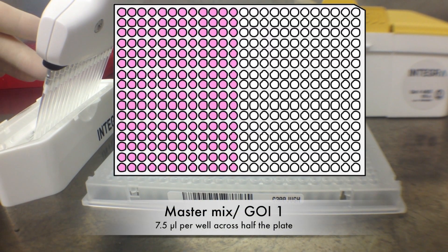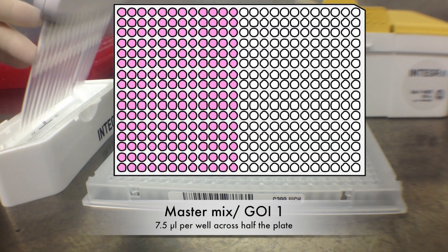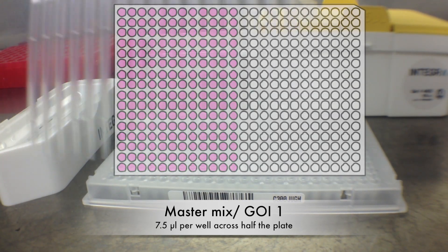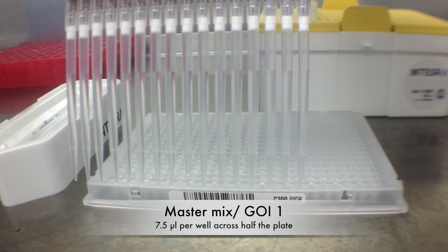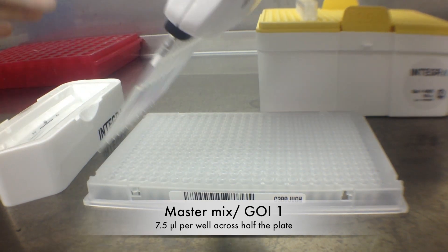Here you can see the layout of my 384-well plate. I want my Gene of Interest master mix to go on the left-hand side. After checking the level of fluid in each of the tips, I then plate it out 12 times.